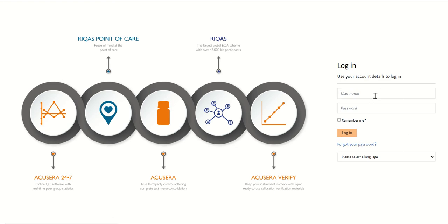And then we have our username and password fields. You will need to type in your username and password. These will be given to you by Randox when you've purchased the software via an email with a uniquely generated password. So go ahead and type in your details.